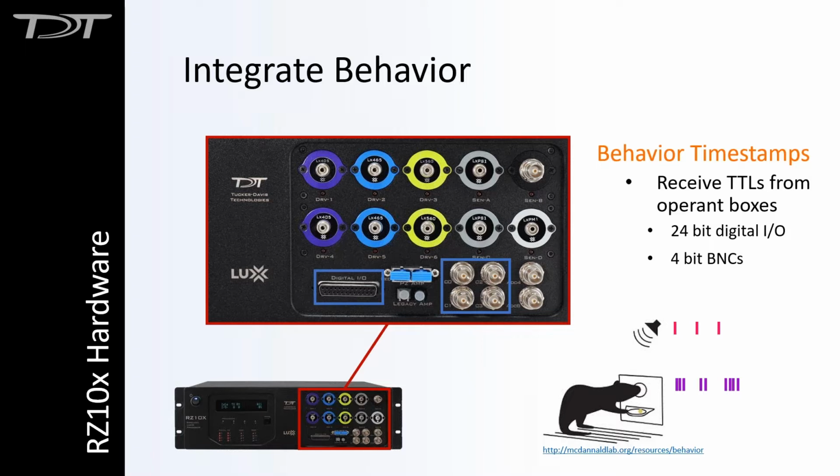And we finally have a question about the LED drivers and how powerful they are. You mentioned that they're low power, but you also said they could be used to stimulate optogenetically, and optogenetic stimulation requires a much higher power level. How does TDT do that? Yes, they do have a range. While we have designed them to be low power, that's their minimum threshold.